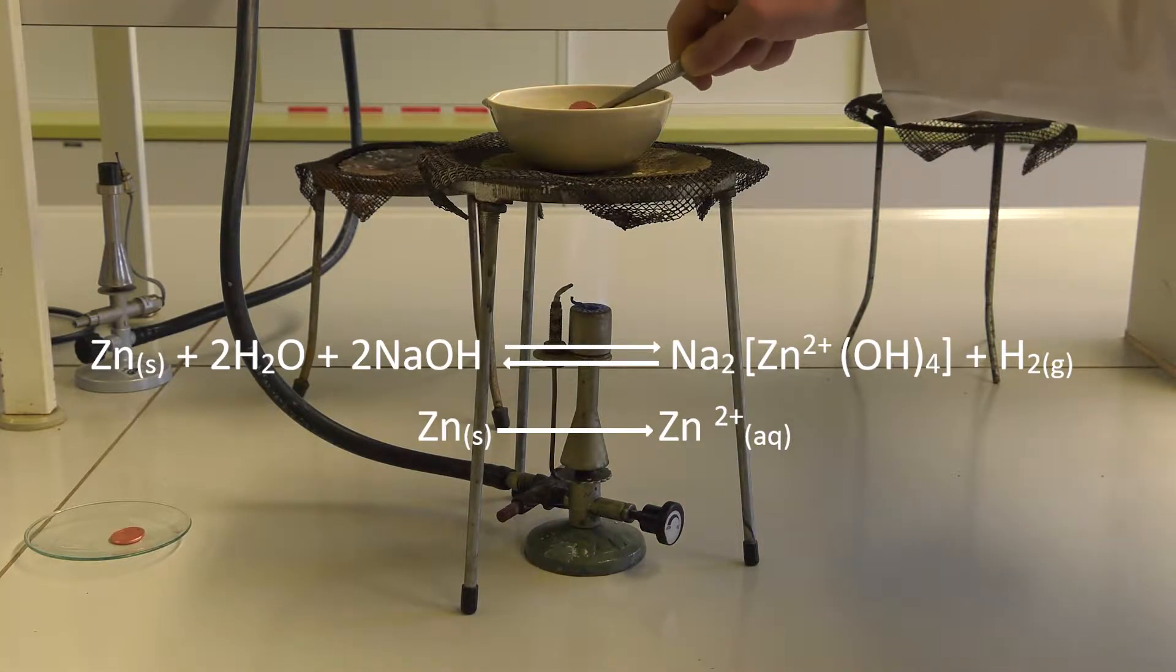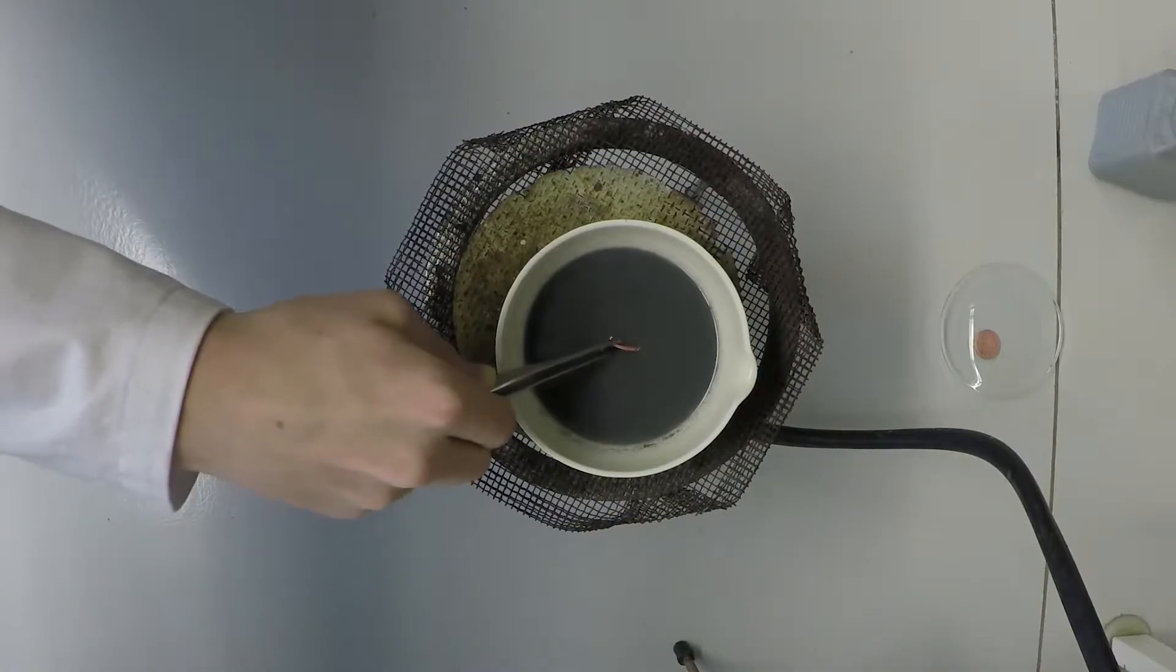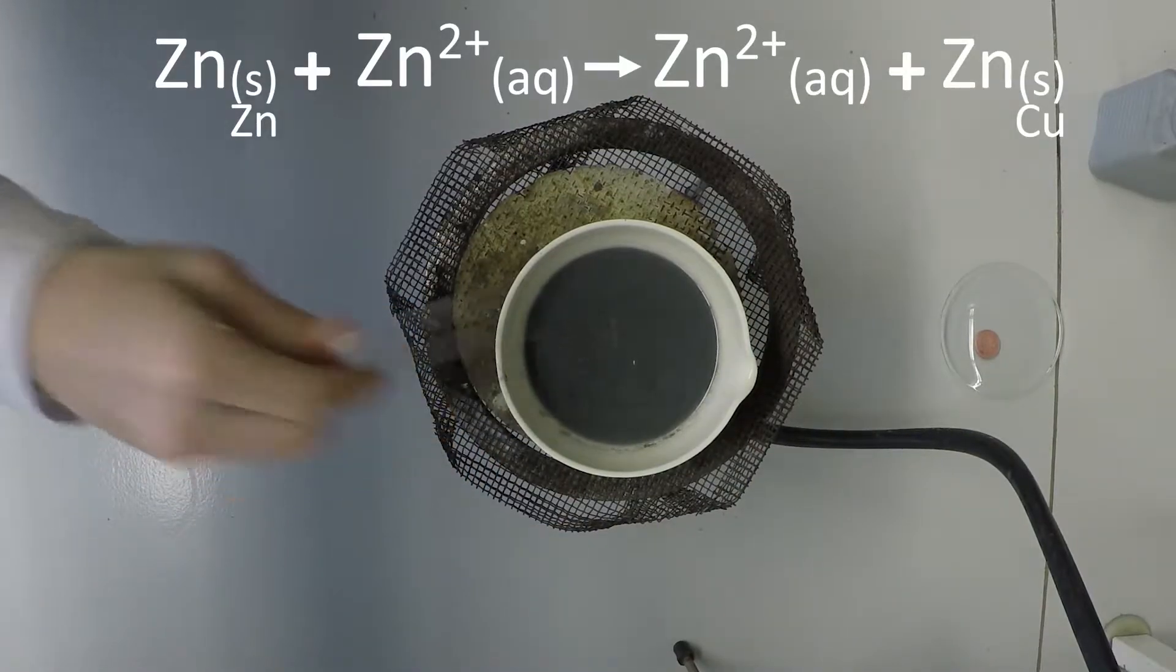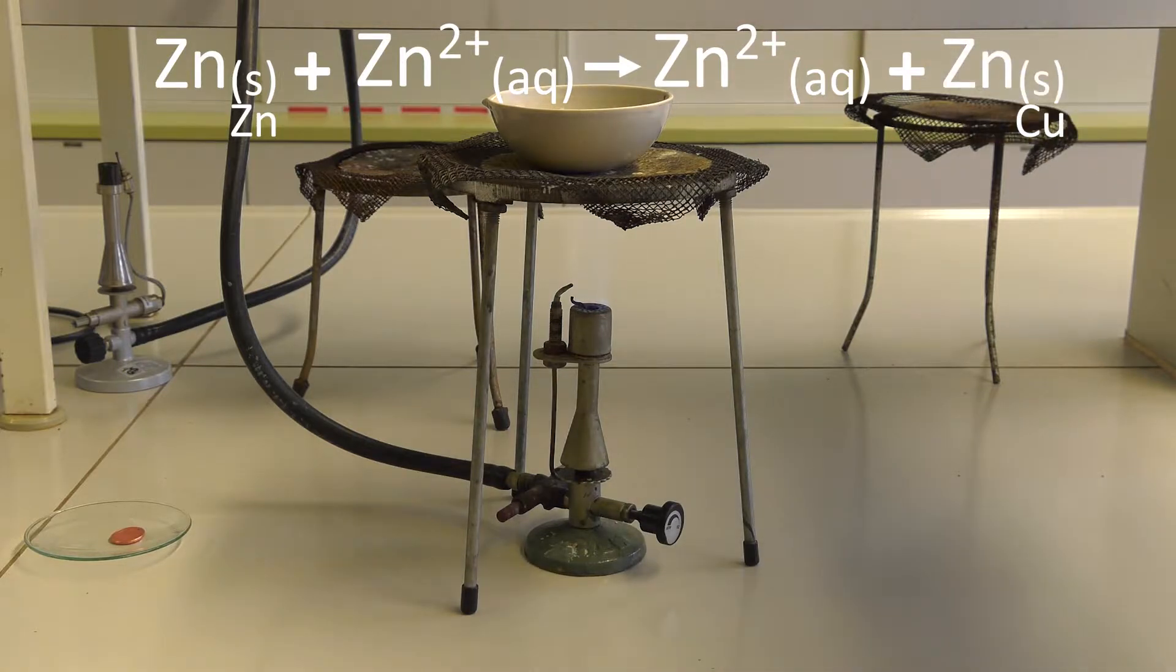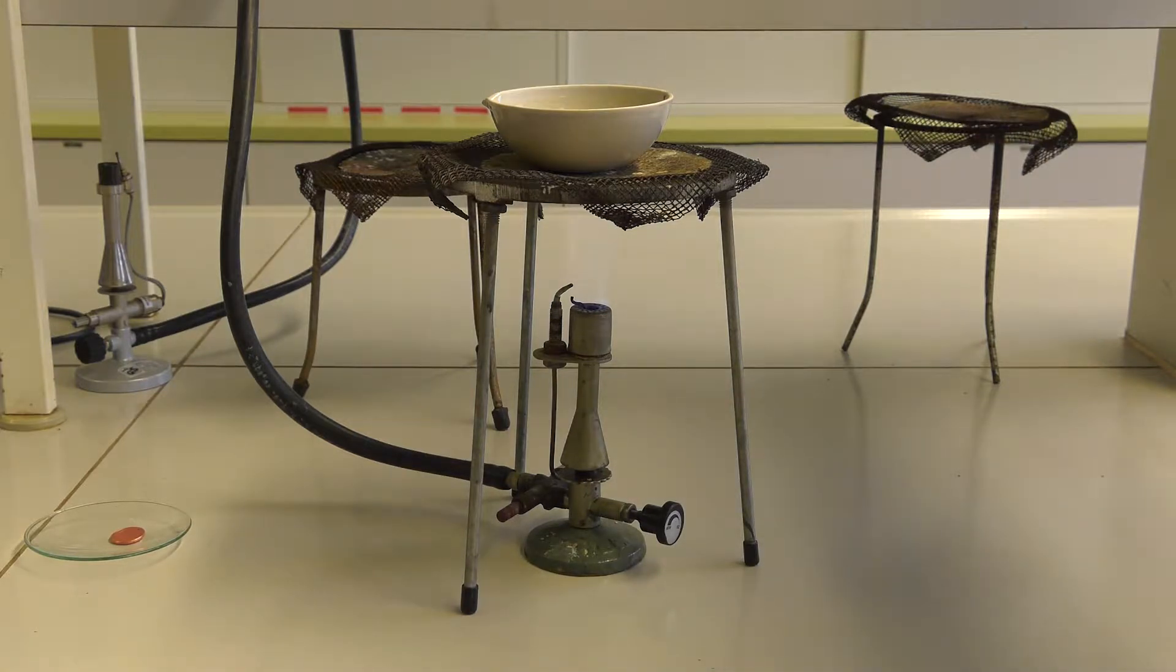Insert the copper coin using tongs into the suspension. After 30 seconds, the coin is coated in a silver colored layer.